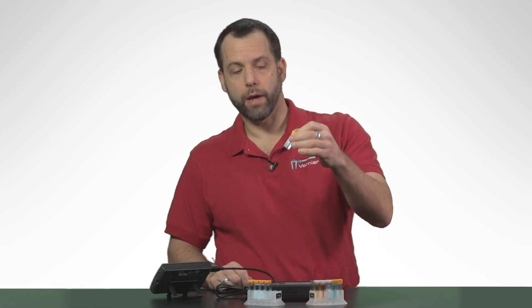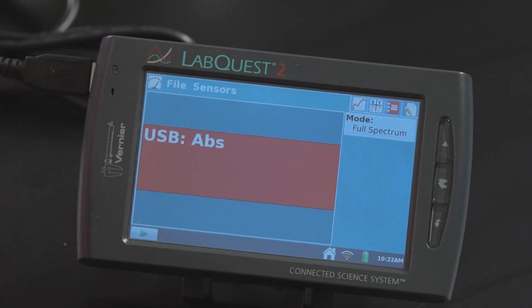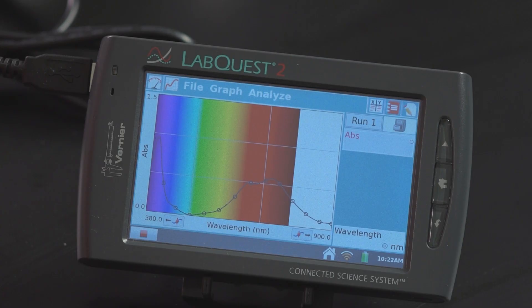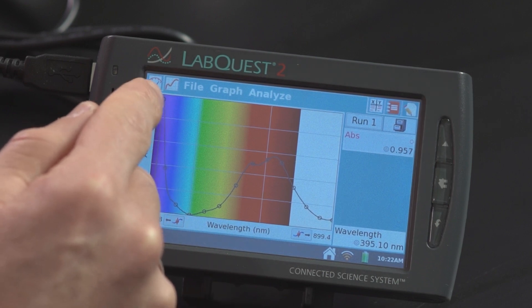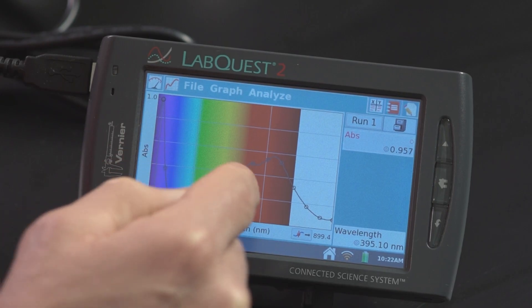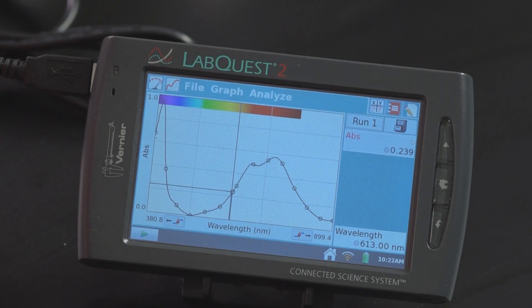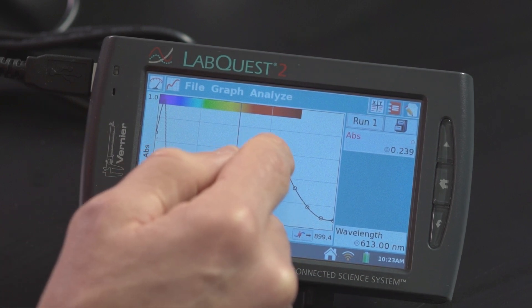So let's take a look at some nickel sulfate. I'm going to put it in the spectrometer, and all I have to do to look at the entire absorption spectra of nickel sulfate is click this little collect button. And that's a nice absorption spectra. You can see right here we have a really high absorbance in the purple to blue, then very little absorbance in the blue to green, and then it increases in the red. I'm going to show you a little trick to minimize the rainbow background — just double-clicking near the top of the graph, just like that. So now you can see peak absorbance in the blue to violet, very little absorbance here in the blue to green, and then an increase in absorbance here in the red.